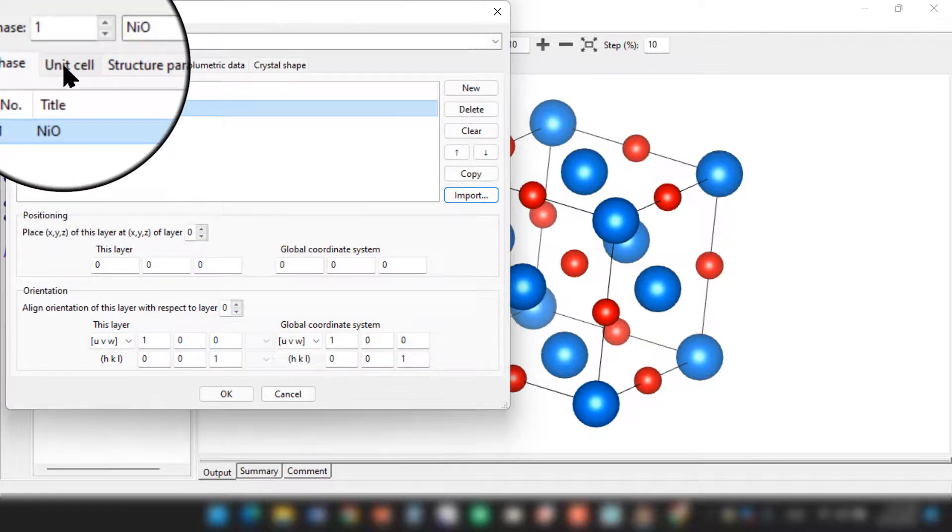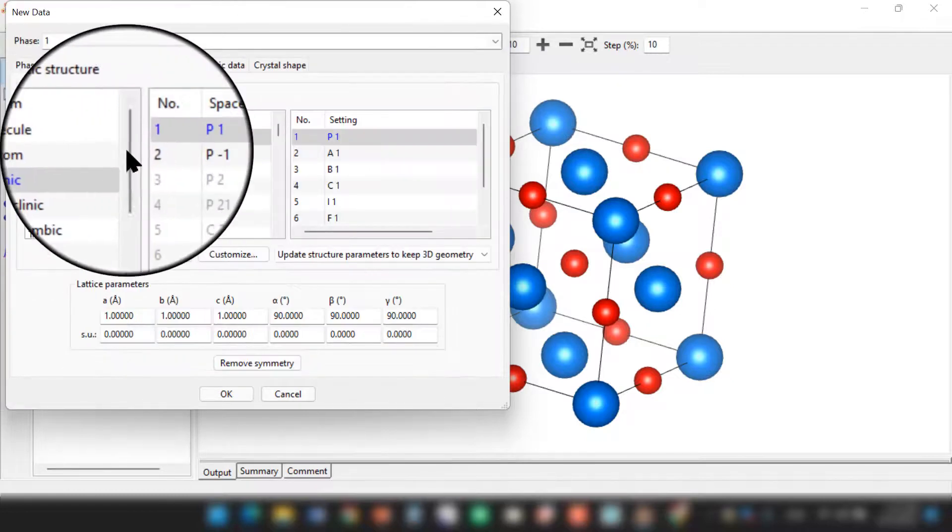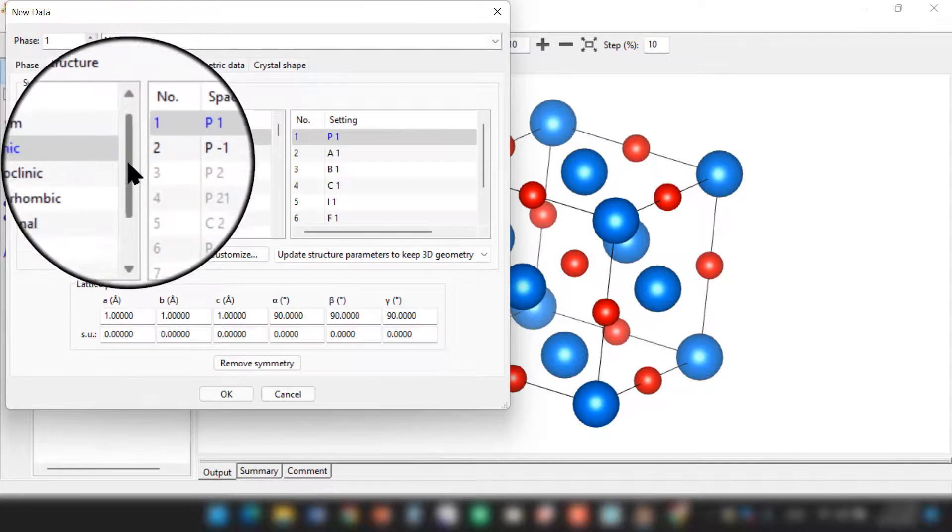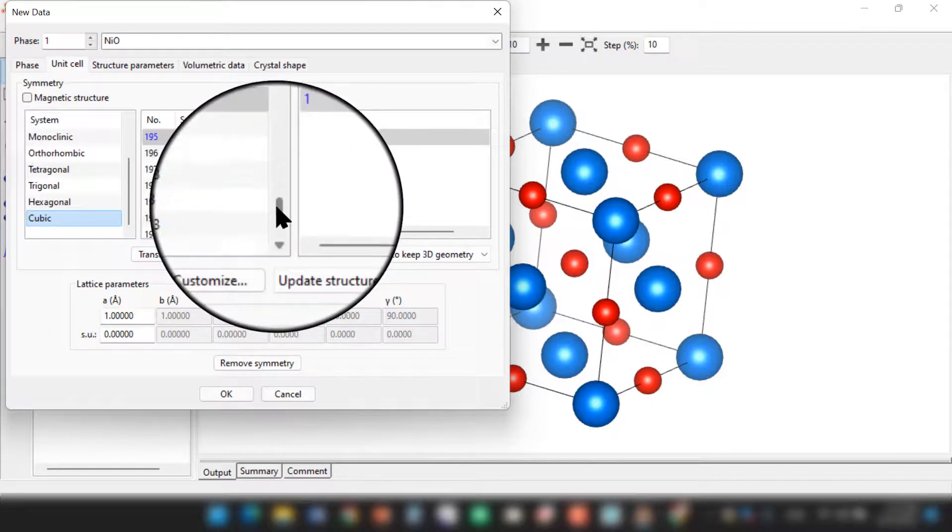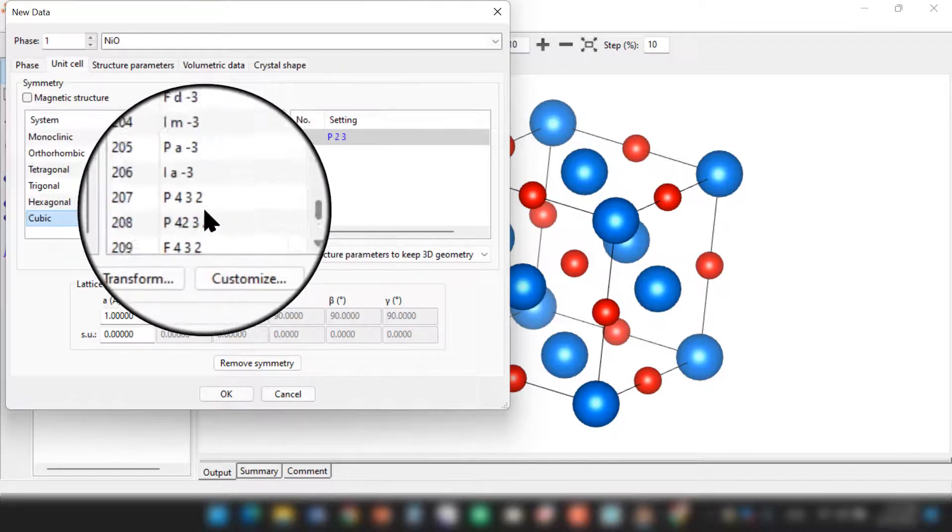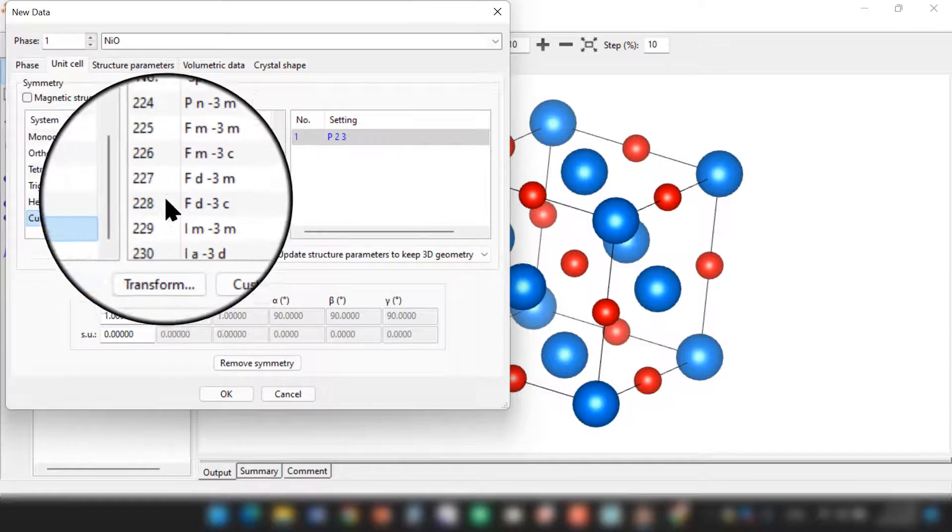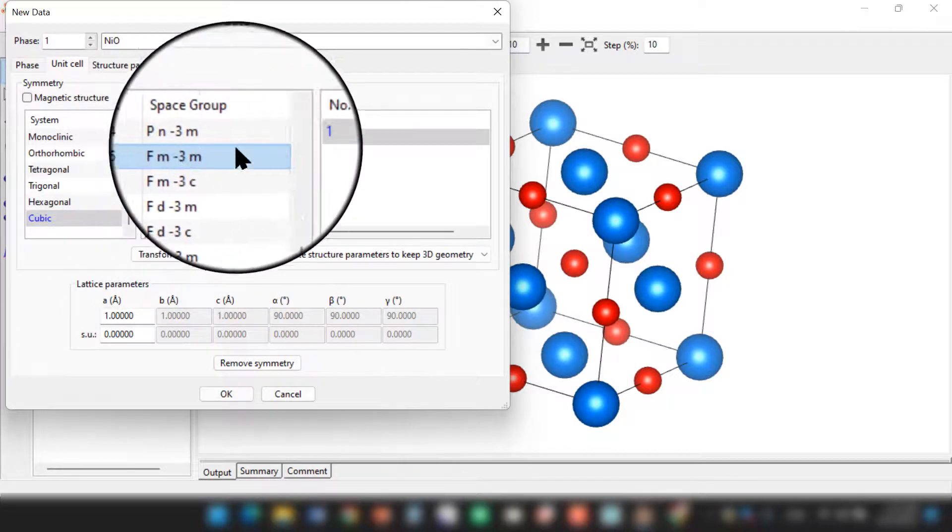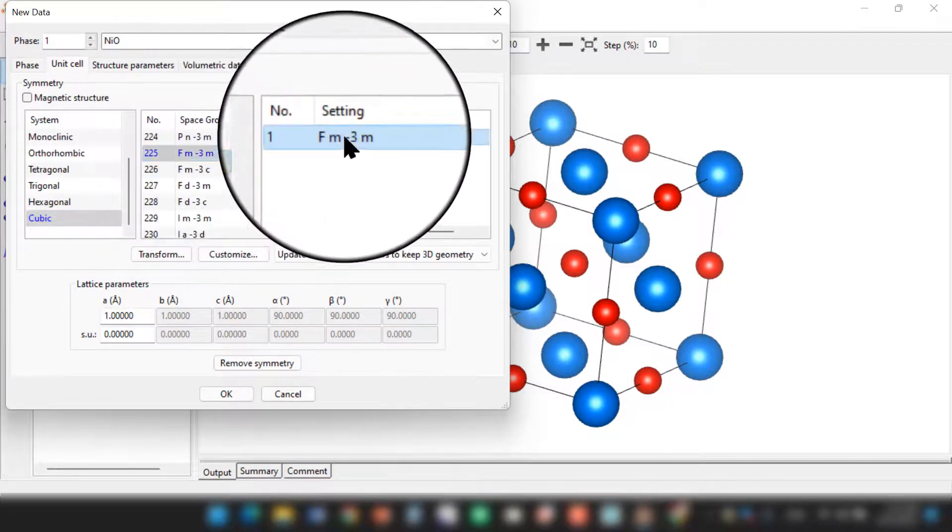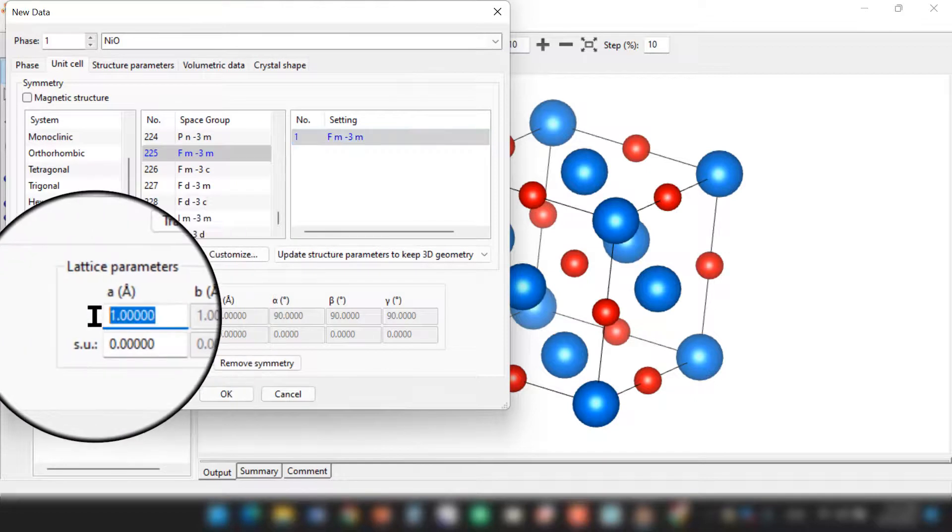Then go to the Unit Cell. As I told, the structure is cubic and the space group is 225. So you can choose 225, which is Fm-3m. Here is the structure. Now the lattice constant here is 4.17 angstrom.